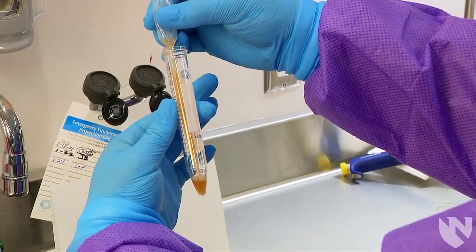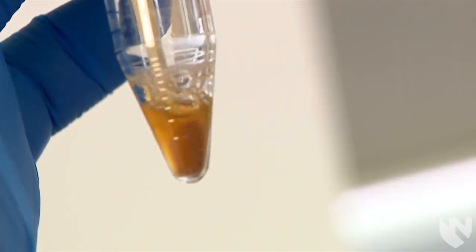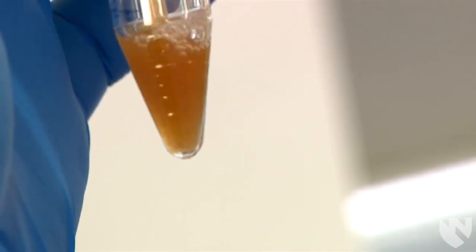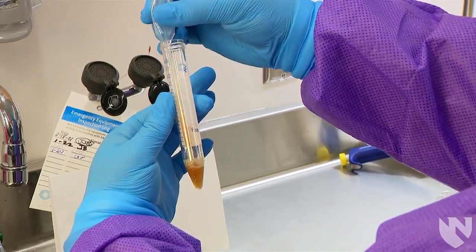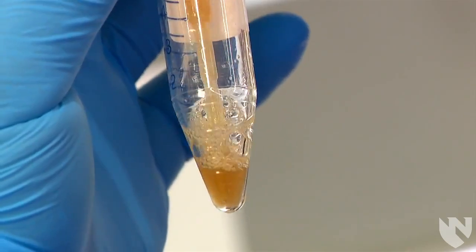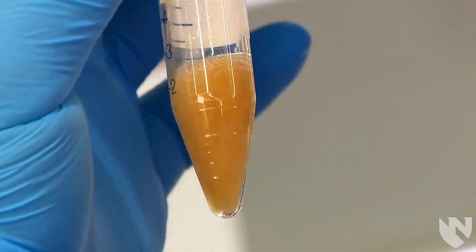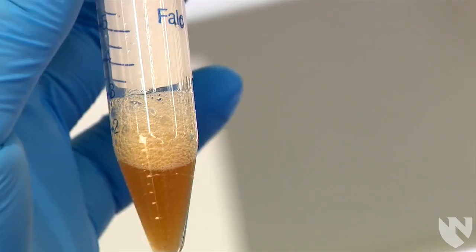Another way to re-suspend the sediment is to use a disposable pipette, aspirate a little of the pellet, and then squeeze the bulb to push the sample back into the conical tube. Repeat the process until there is no longer a pellet at the bottom. The drawback of this method is you might introduce bubbles, so only aspirate a bit of the sample and do not squeeze the bulb too hard when putting the sample back.